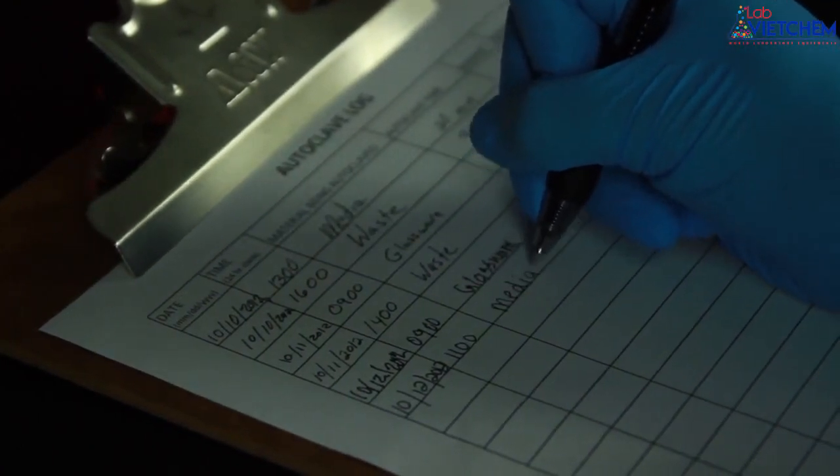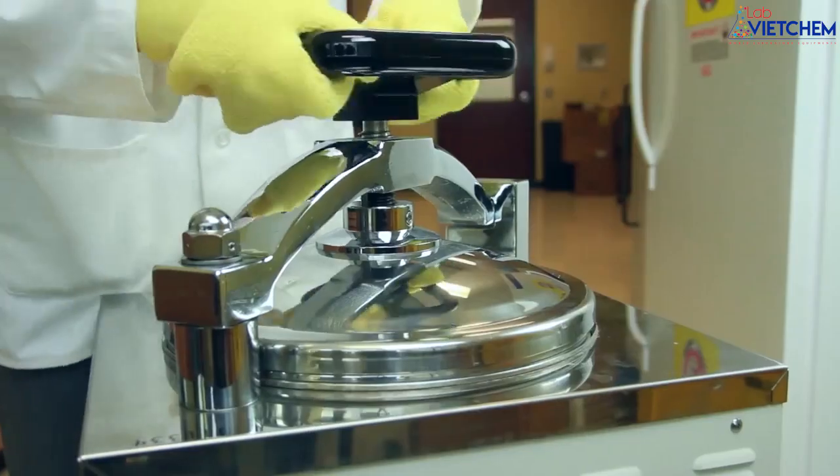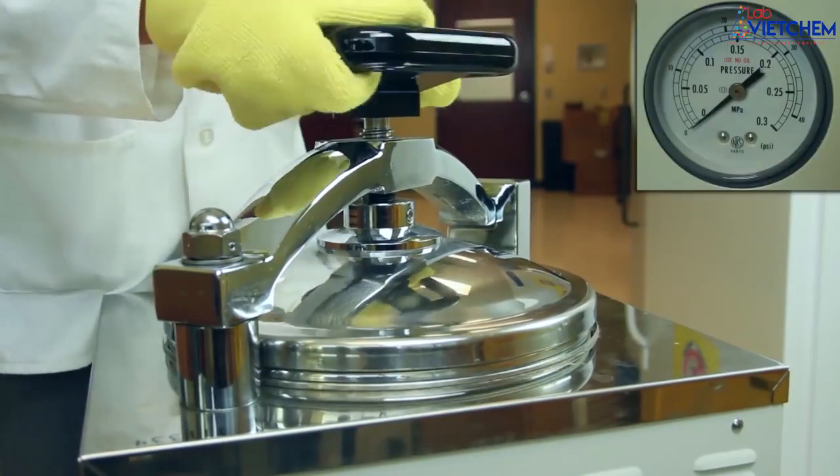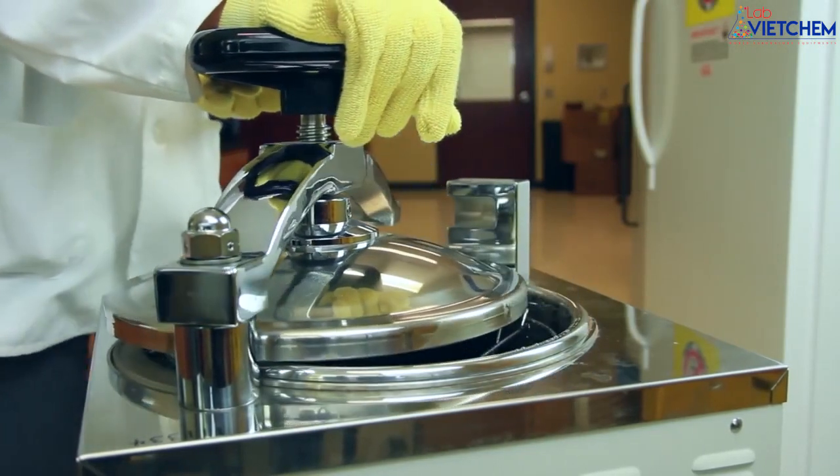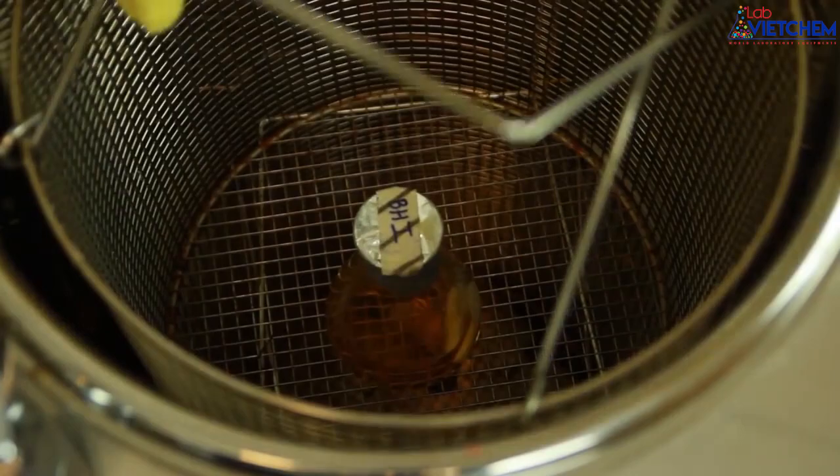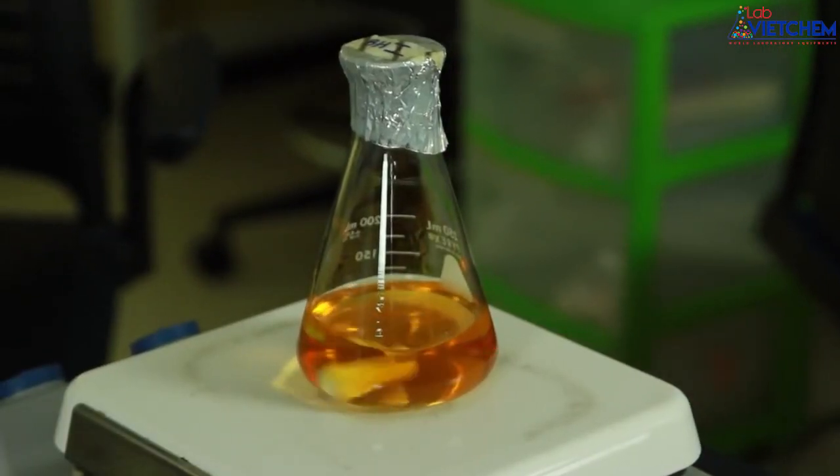While it's running, enter the date and time and the operation details in the log and initial. Once the cycle ends and the pressure gauge reads 0 psi, slowly open the door wearing heat-resistant gloves. The black lines are visible on the autoclave tape indicating that the proper temperature was reached.